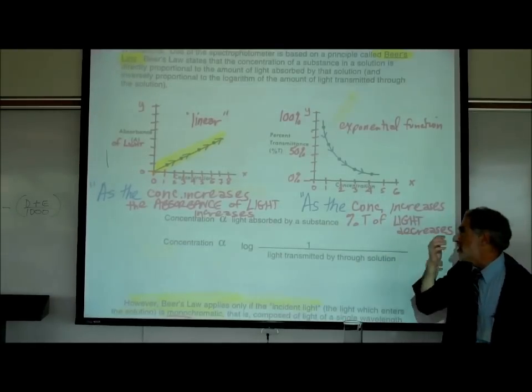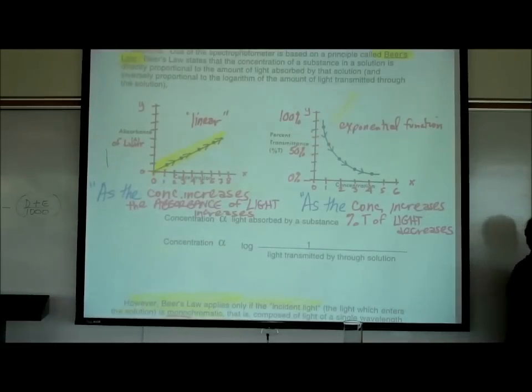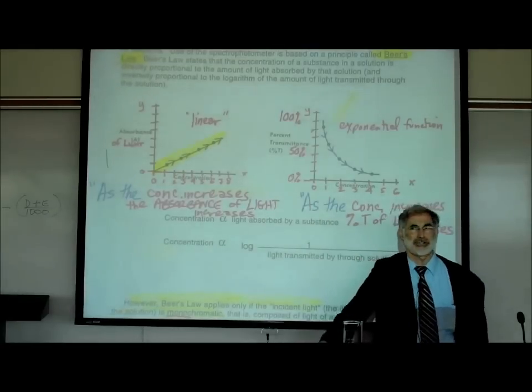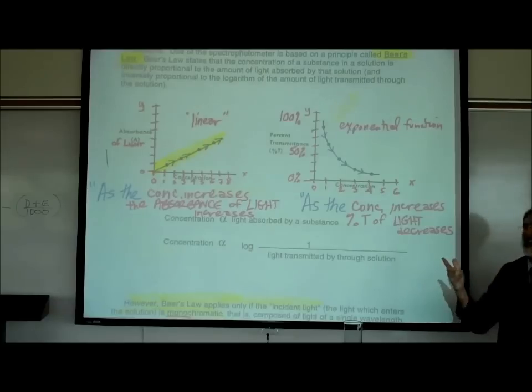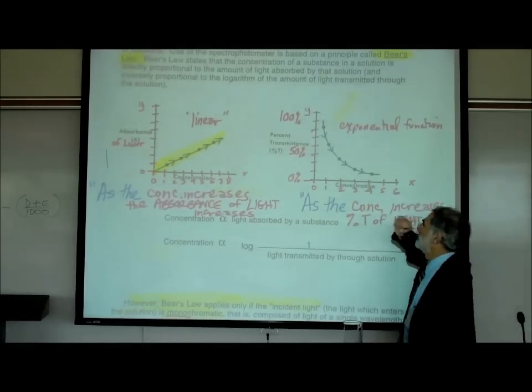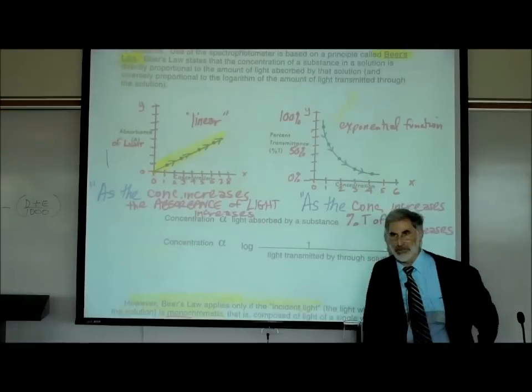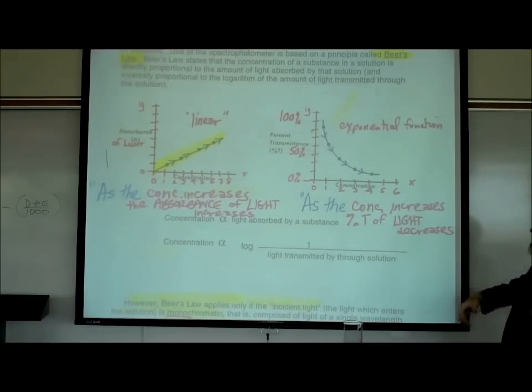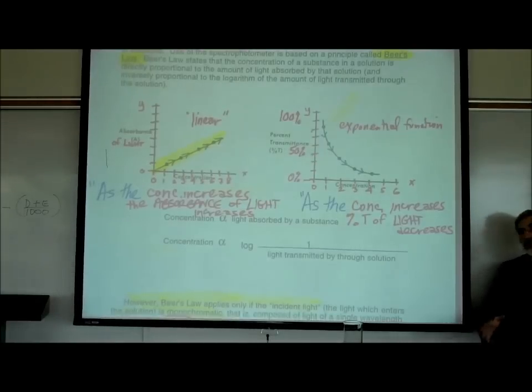The units are irrelevant. We're simply saying that we're increasing the concentration. It could be in percent concentration, it could be molar concentration, it could be ratio concentration. We're simply indicating increasing concentration of glucose or potassium or cholesterol or whatever it is we're measuring in that solution. What's plotted on the vertical y-axis is the percent transmittance of light. How much light is getting through this solution? Now, notice that here's the graph line, and this graph line shows the relationship.